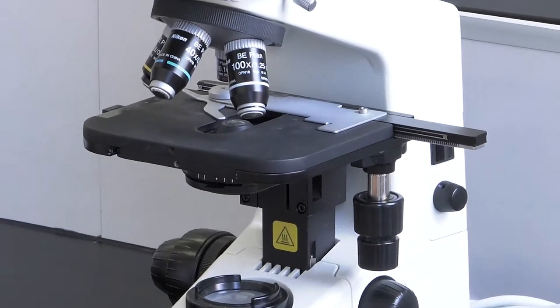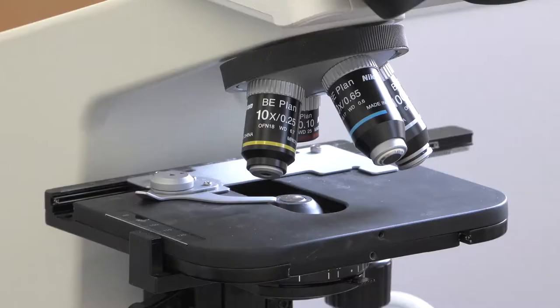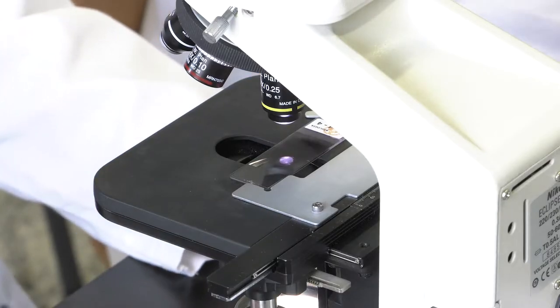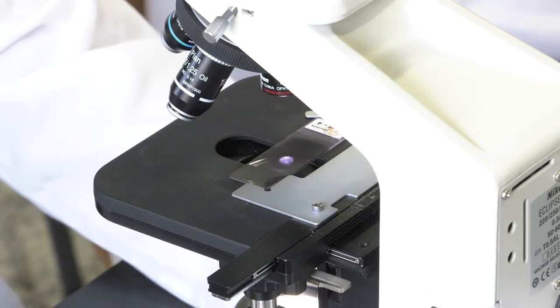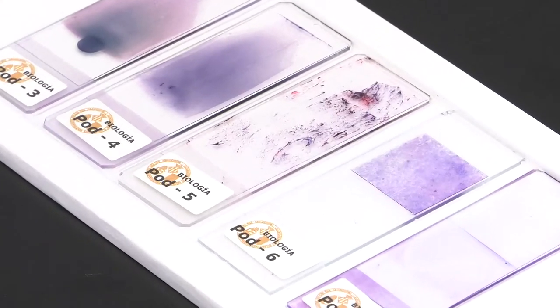The stage is located on the arm of the microscope. It is the surface where the preparation that we want to observe will be placed. And what is the preparation that we are going to observe with the microscope?